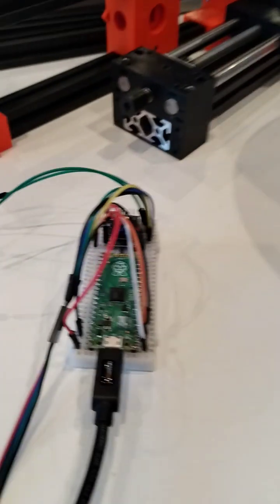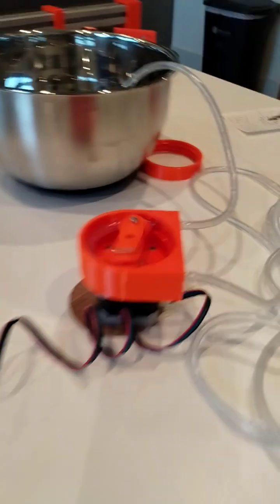Here's the finished result. It's hooked up to a driver and a Raspberry Pi Pico W, and with the code here, if I hit F5 and run it, it starts going.